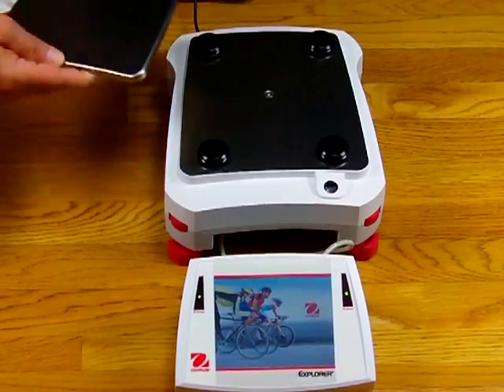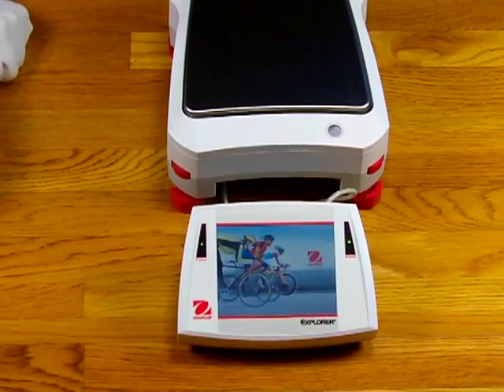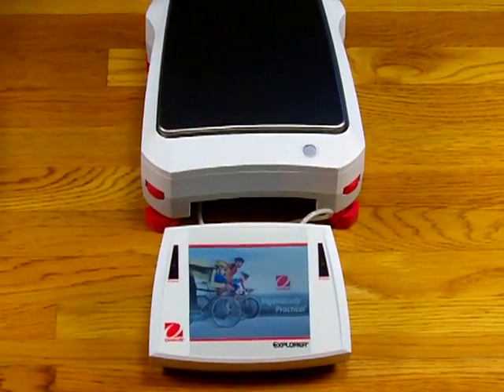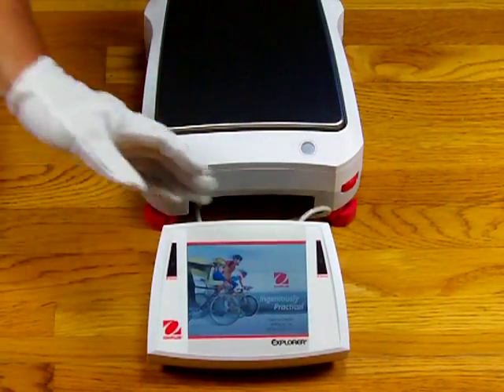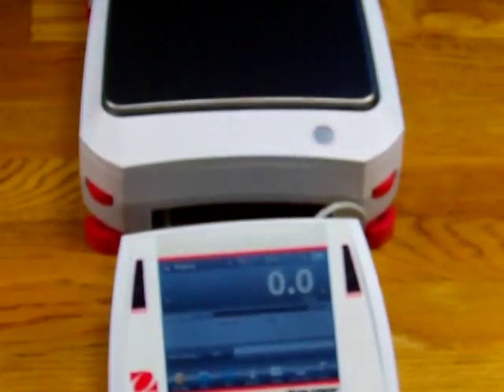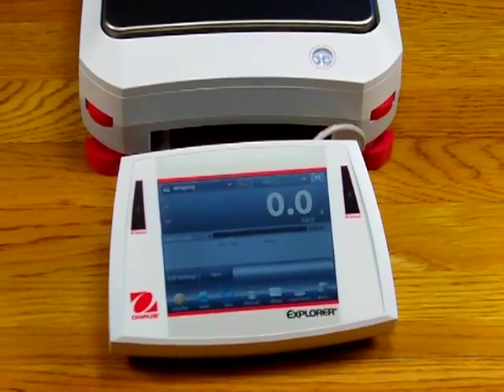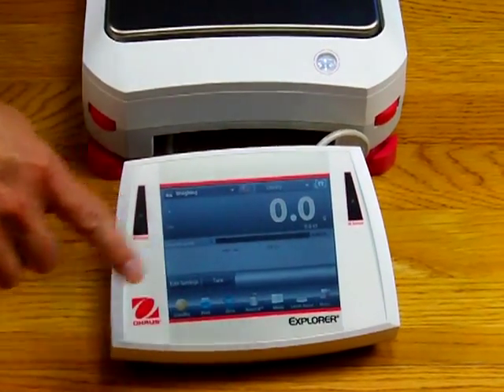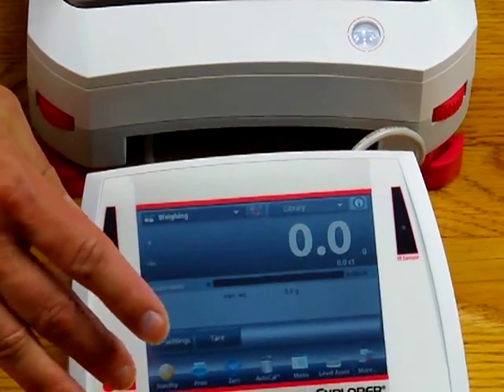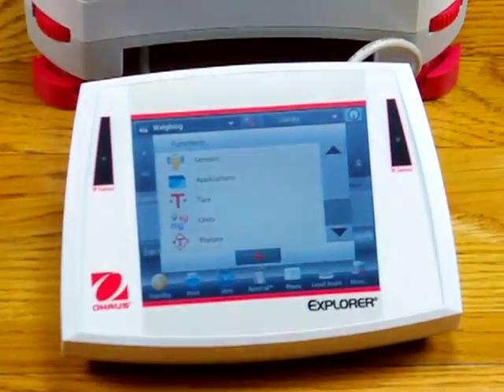I'm going to plug this balance in one more time to show you some of the nice features — the trapezoid weigh pan and windshield for easy cleaning. As you can see when the balance powers up, it shows the Aarhus logo in standby mode. Simply press the center button to get out of standby mode and the balance powers up. Looking across the bottom of the balance, we have standby, print, applications, auto calibration, and menu. There's a button to see more options — everything is simple scroll up and scroll down.